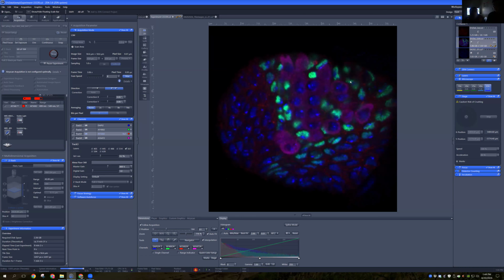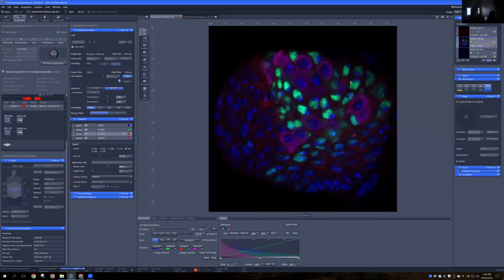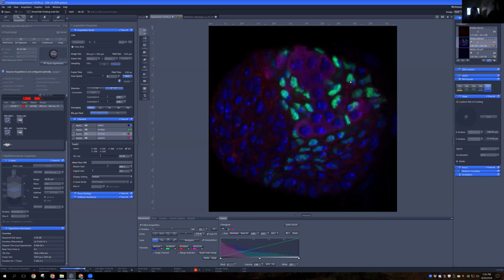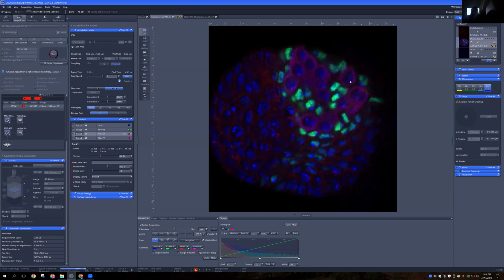I think tomography is a general technique that refers to concentrating an energy source at a certain distance along a sample point. The reason Michaela points it out to me is because there's also cryo-electron tomography, which is actually in the name of the technique, where you focus electrons at a certain distance within a sample so you can image it. But yes, tomography is a general term that refers to taking an image at a certain point along a z-axis, and so yes, this is a form of tomography.